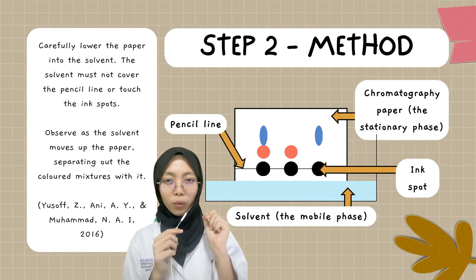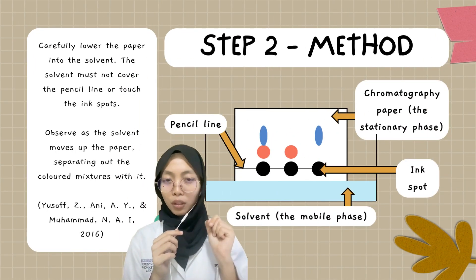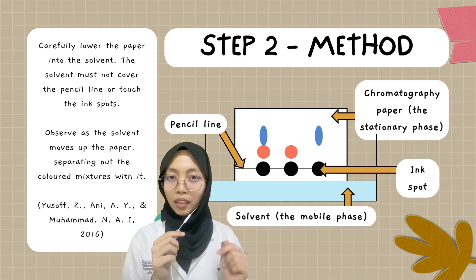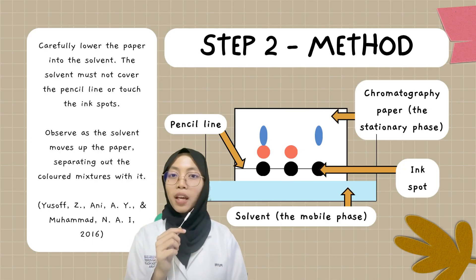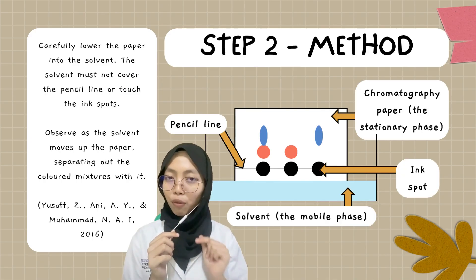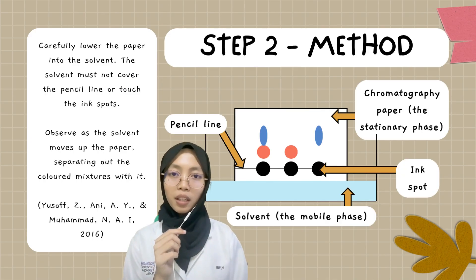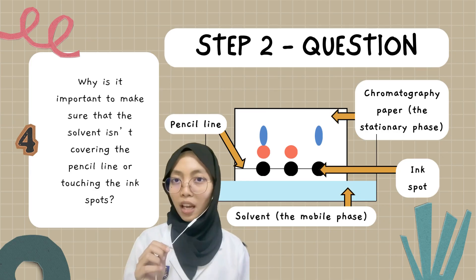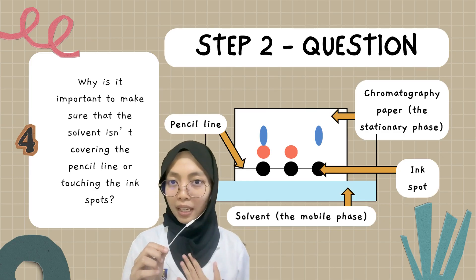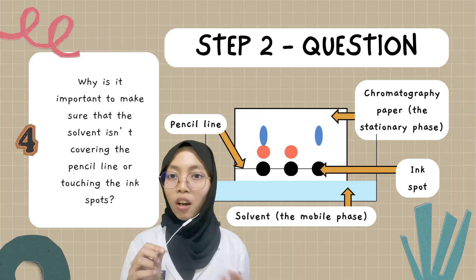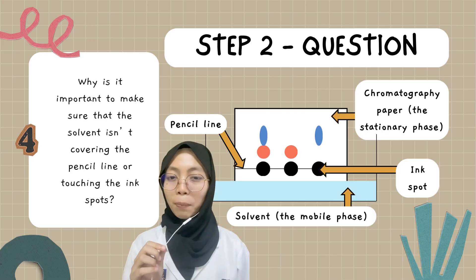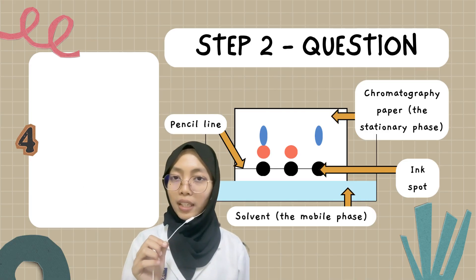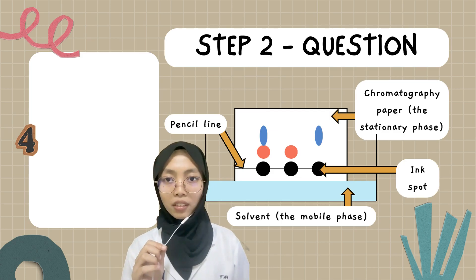Step two: carefully lower the paper into the solvent, but the solvent must not cover the pencil line or touch the ink spots. Then observe as the solvent moves up the paper, separating the coloured mixtures. It is important that the solvent does not cover the pencil line or touch the ink spots because the solvent would wash away the ink and affect the result.